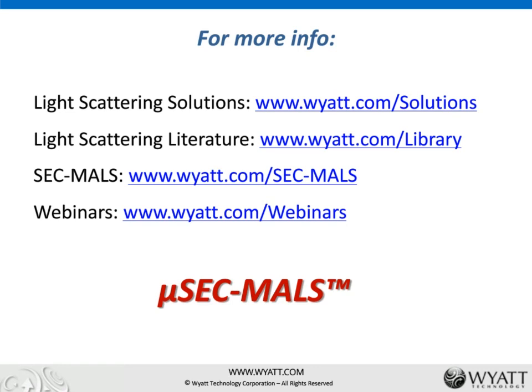Sorry, I cleared it off my screen, but I think it was, do you have any suggestions for columns that work particularly well for protein separation? Okay, so for our studies, we used mostly the Waters BEH columns. I know there are some other manufacturers that also offer those 2 micron particles as the stationary phase now. But for most of our studies, we use the Waters BEH columns, and they seem to work well.